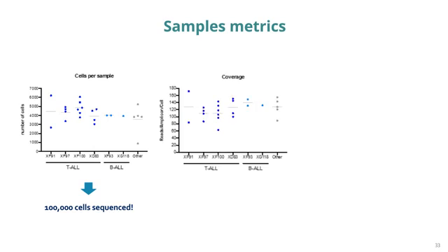And then the coverage, which is the number of reads per amplicon and per cell, you can see here was very high for all of the samples. Normally, the recommended average coverage per sample is 80, so that you can also annotate variants from the low-performing amplicons. And you can see here that for most of the samples, we are above 100. And normally you cannot get this level of coverage and resolution if you just do, for example, a whole exome or whole genome sequencing.